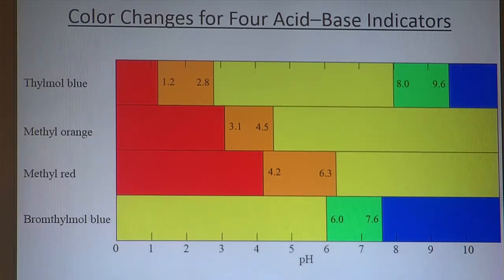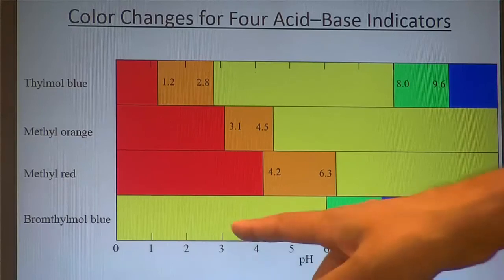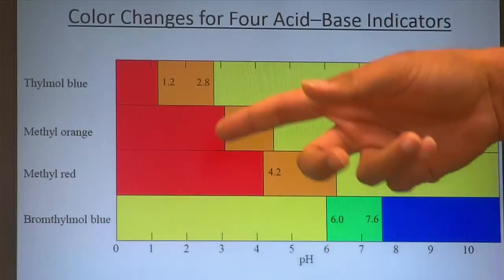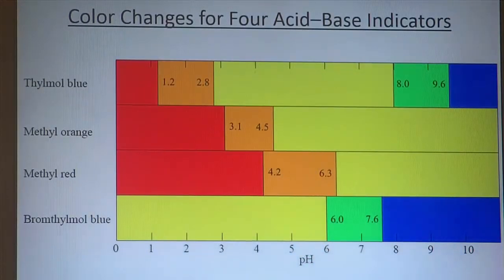So 3 different types of measurements for pH. Like I said before, the pH meter, these pH strips, we have the wide range pH strips, we have the narrow range pH strips, and also the third method would be using these indicators. Make sure you choose the right indicator. If you put one indicator in and you get something that's very broad, you probably have chosen the wrong indicator. So take more of that sample and put in the right indicator so that you get a more narrow range of the pH for that particular sample.